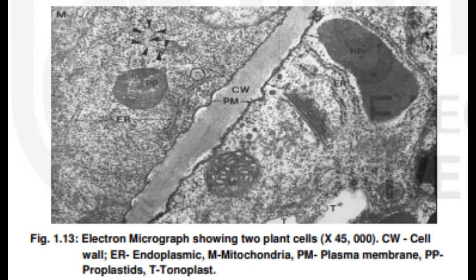1.3. Scanning electron microscopy, SEM. In the scanning electron microscope, an electron beam moves over the specimen. The molecules get excited and move to a high energy level and emit secondary electrons. These electrons are used to form an image of the specimen.